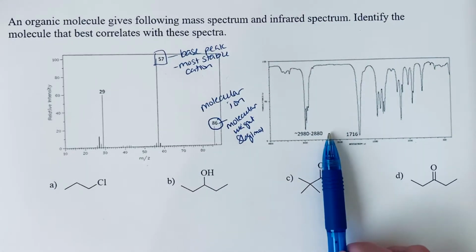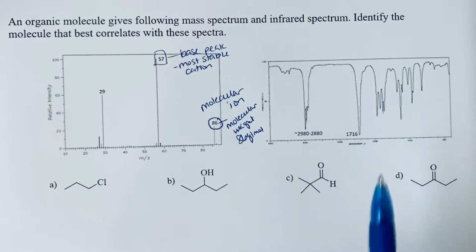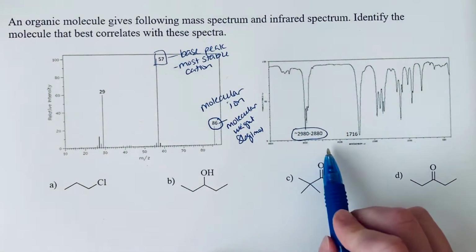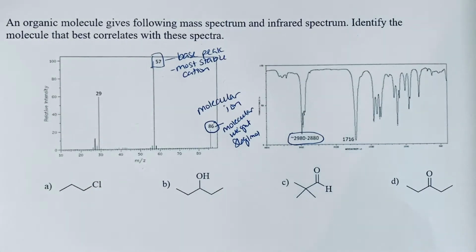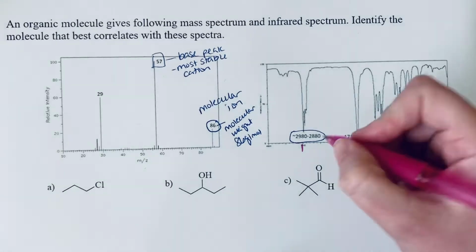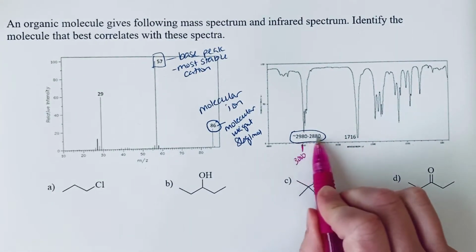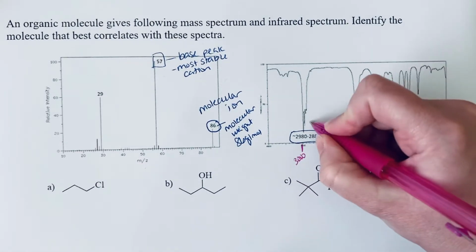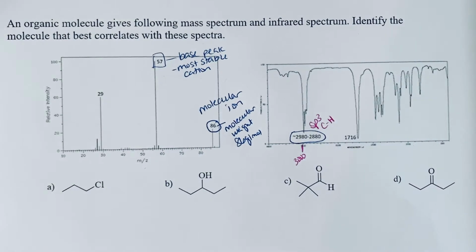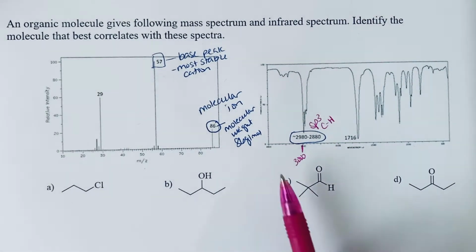This higher part of the infrared spectrum is where we see bonds to hydrogen. We see one set of labeled bonds in this area, and they are just below 3,000. This is the 3,000 mark. Those CH stretches just below 3,000 are sp3 hybridized carbon-hydrogen stretches. That's not unusual to see, because every single one of these molecules has an alkane. So we'll see what else we can see.